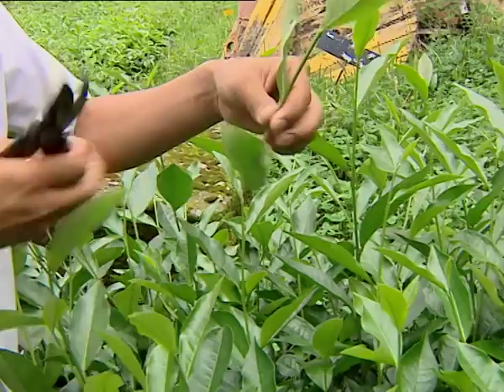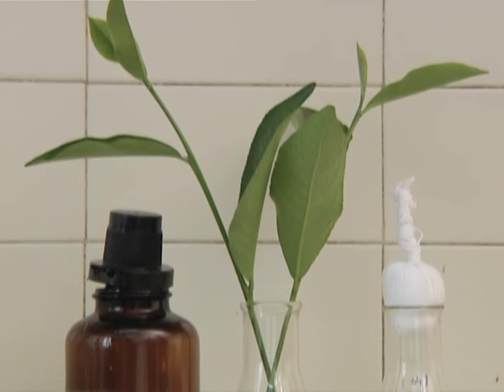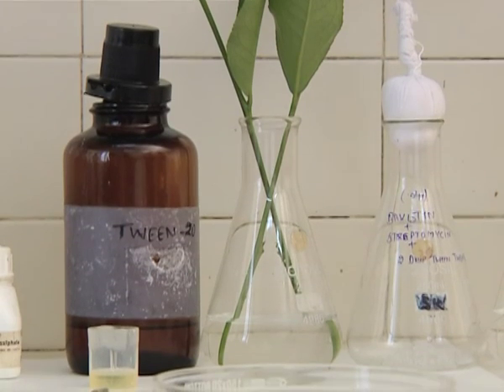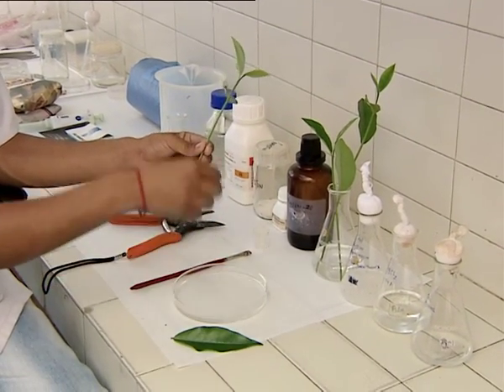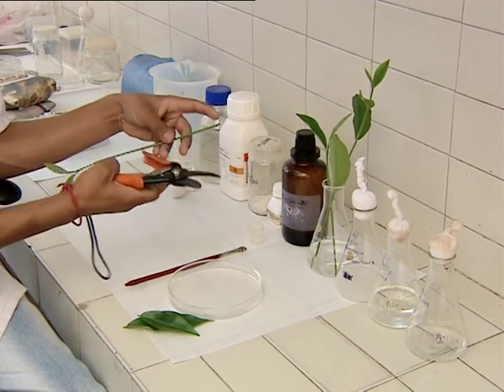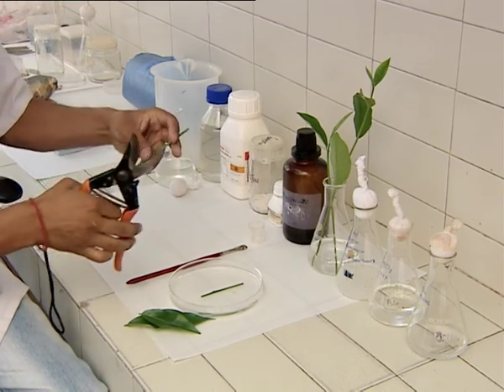Immediately after collection, the explants are placed in clean water to avoid the entrance of air bubbles, microbes, and contaminants from the cut or exposed parts, and to avoid browning due to phenolic oxidation. These explants are then brought into a laboratory for surface sterilization. For this, the explants are first cut into smaller size using a scalpel or a pair of scissors and then placed in a petri plate containing clean water.